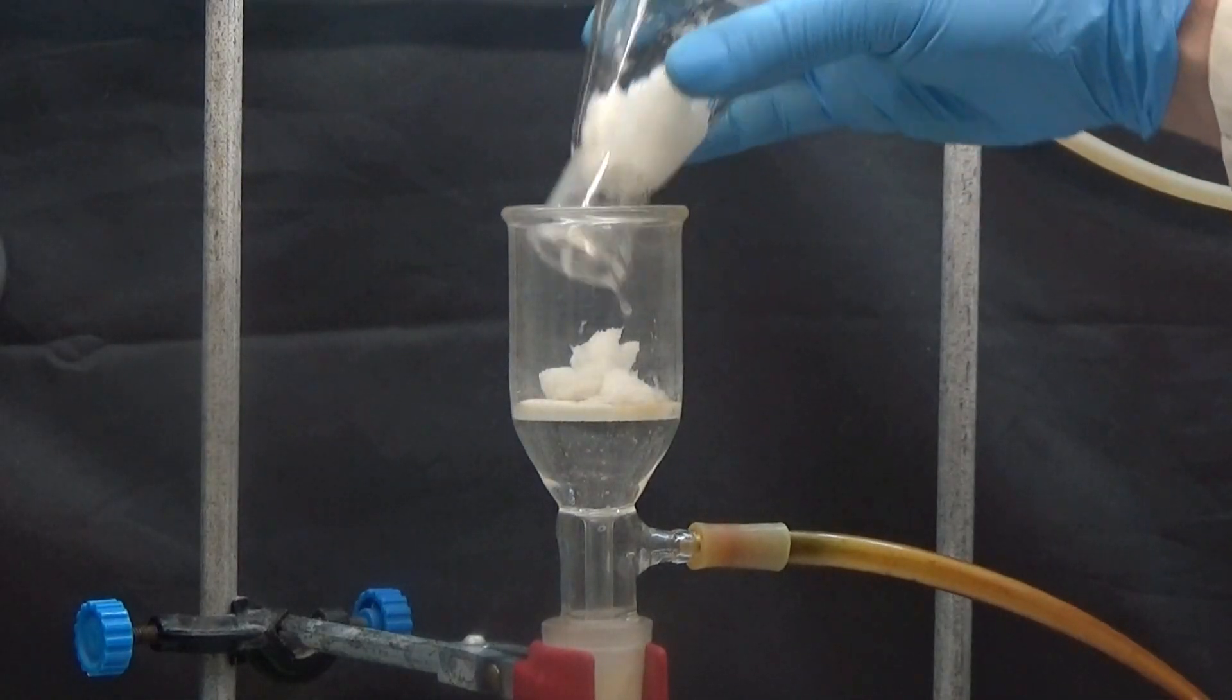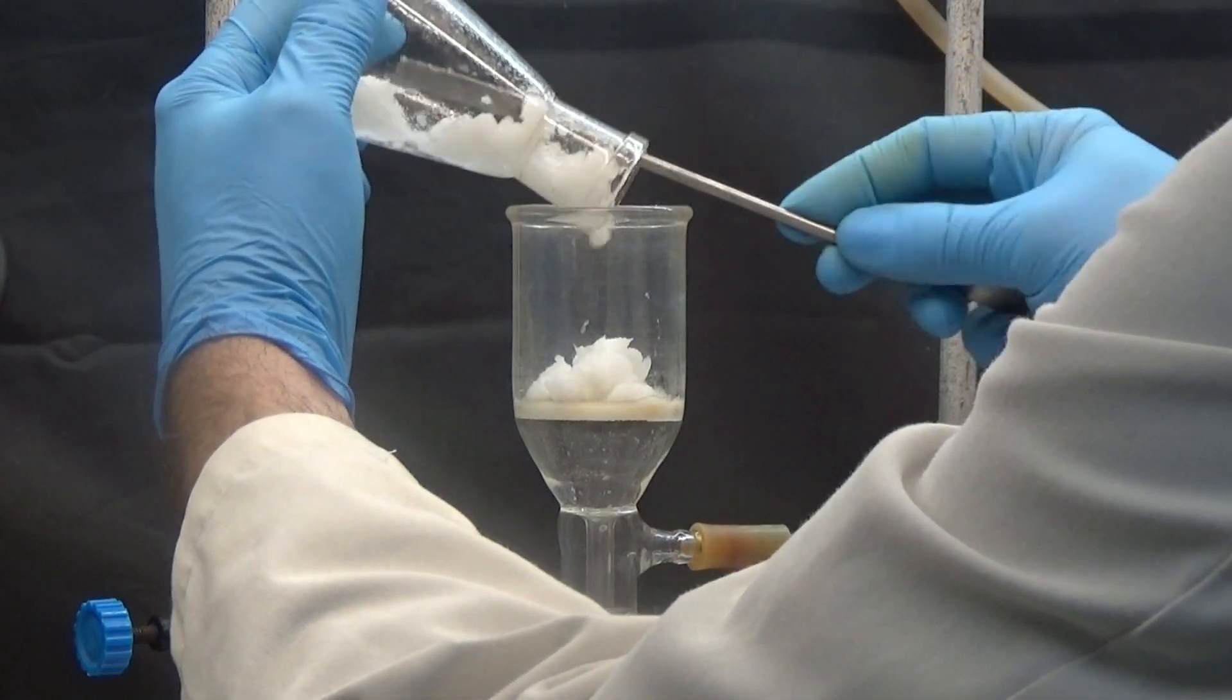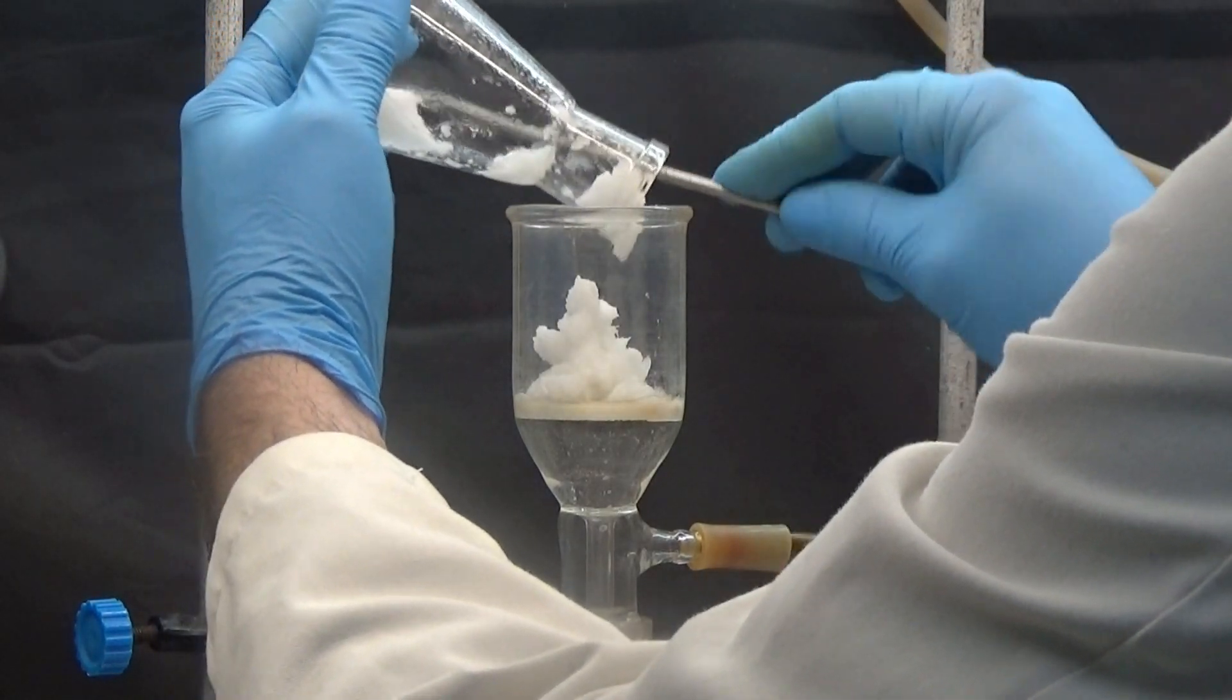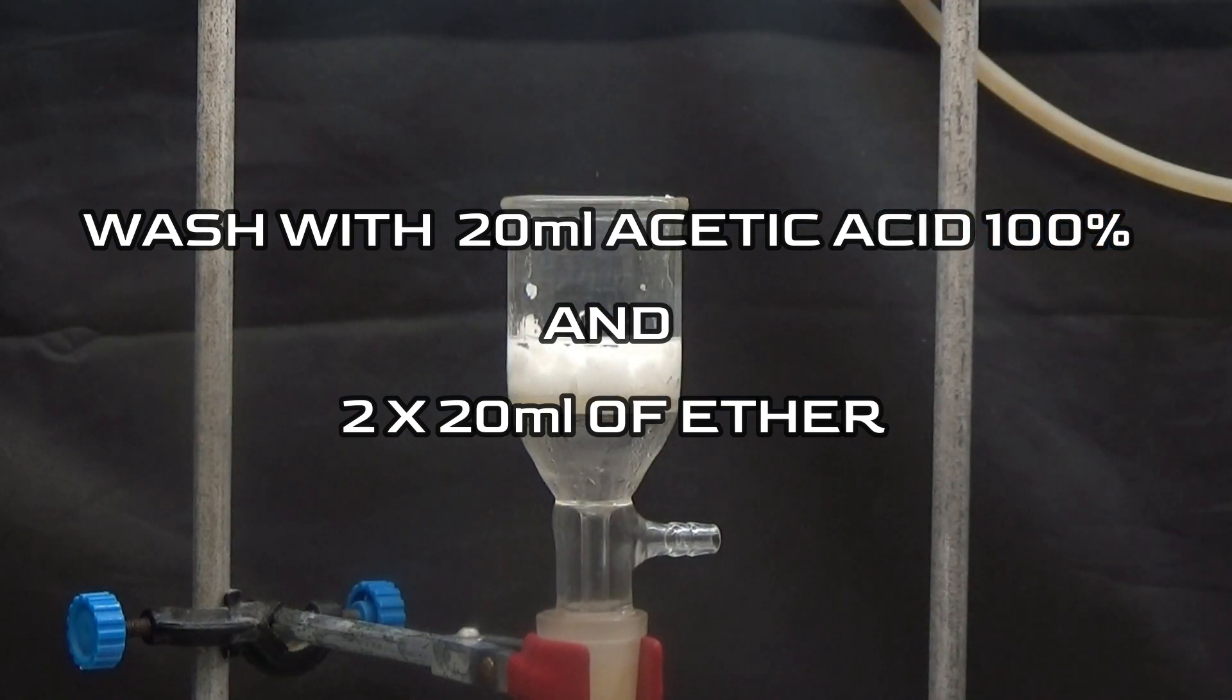Vacuum suction is used to collect it. Wash the solid with 20 milliliters 100% acetic acid and twice with 20 milliliters of ether.